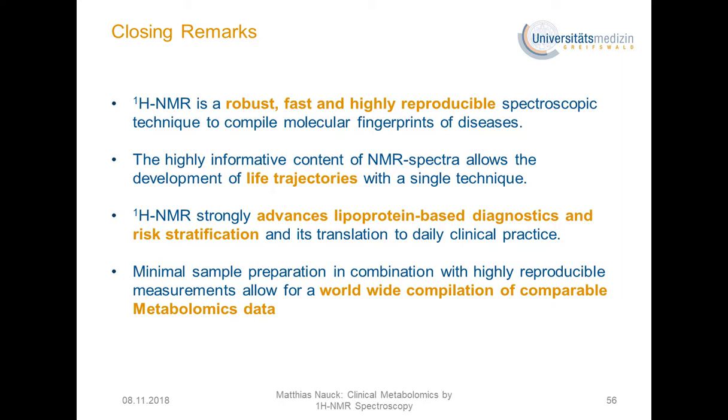So I want to summarize my talk. The NMR is a robust, fast, and highly reproducible spectroscopic technique to compile molecular fingerprints of diseases. The highly informative content of NMR spectra allows the development of life trajectories with a single technique.